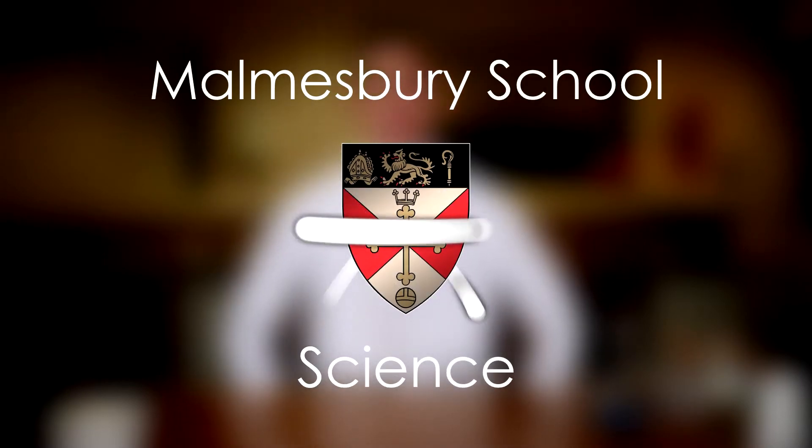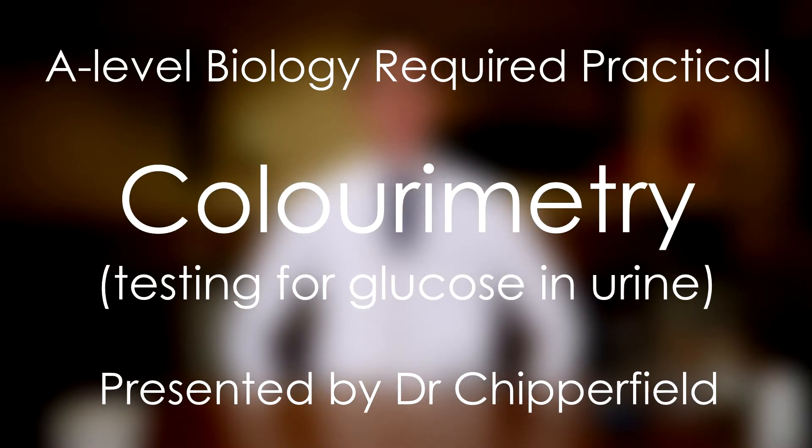Hello there, it's Dr. Shipperfield from Marsbury Science. Today we'll be doing a required practical where we are going to identify the concentration of glucose that is in three samples of urine.